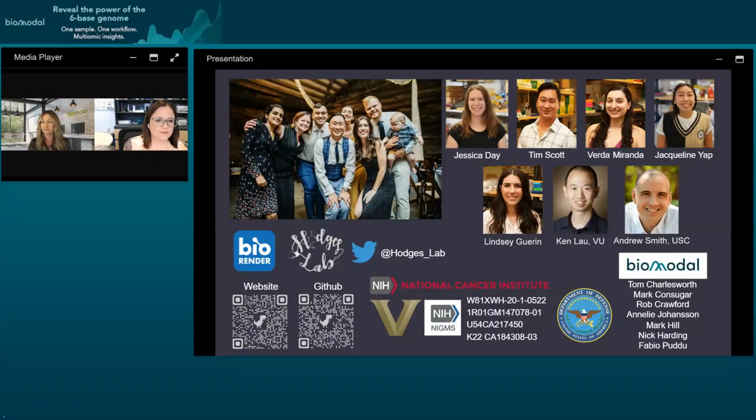Major difference. Well, there are several differences, but the one major difference is that you're not using sodium bisulfite to deaminate the DNA. So it's not as damaging to the DNA as bisulfite sequencing is.